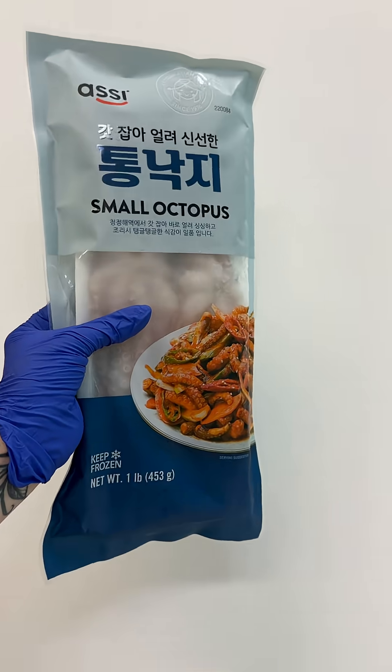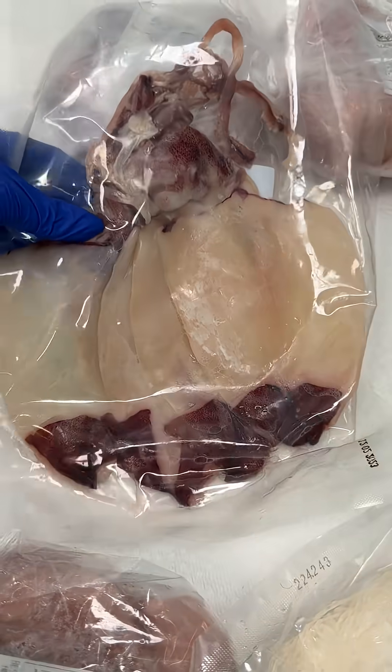First, we purchased the specimens already frozen from the grocery store, so don't worry — we did not catch these in the wild.